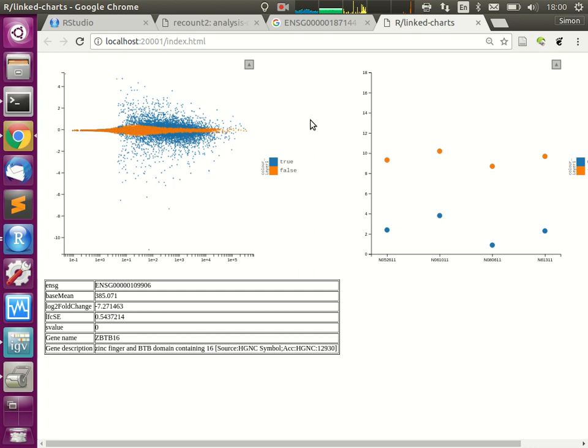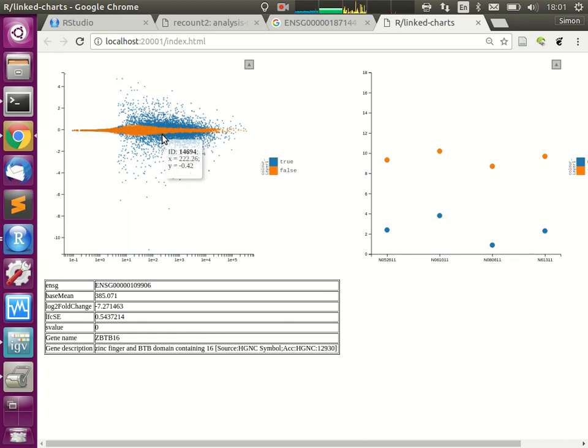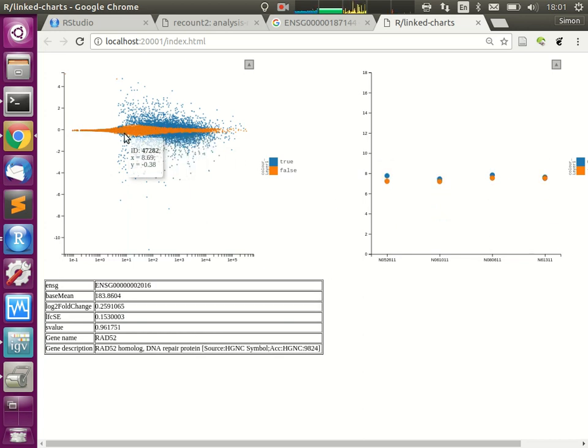Now, as I said, things are a bit busy. I've pulled a lot of different things together. So what I've shown here today is, first, we recapped our analysis. Second, we looked a bit at individual genes to get a feeling of how these things typically look. And, oh, this is a nice one. Here, for example, you see something where 2 of the cells react strongly to this and 2 don't react, which is considered non-significant, but it shows you the value of trying it on many different cell lines.